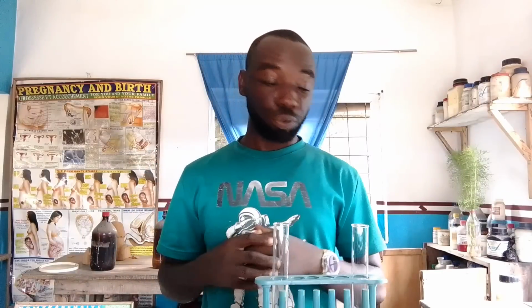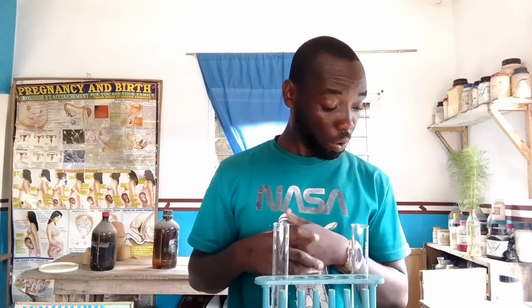From the instruction, we were asked to provide sodium hydroxide and 1% copper solution. So we are going to be preparing it right now and carry out the experiment as you are going to see it on that very day of your biology practical.